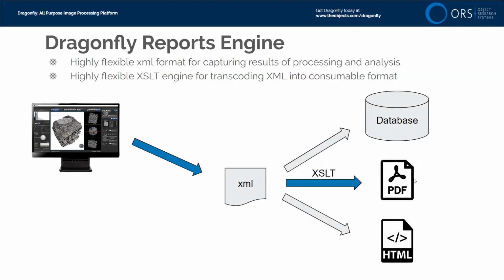The user could at some point later say, well, I don't like the format of our reports. Then rather than having to regenerate all of the data, you would just change the style sheet. So you would change the style sheet lookup transform, or whatever the L is. You would change the XSLT so that you could then reprocess all of those XMLs into new reports with the new form. So that's the beauty of encoding it in XML. That is not designed to be human consumable, but you can change this so that you can change the format that it is consumed in by humans. But this is highly extensible if you are working in part of an enterprise group that captures lots of, oops, what is that?